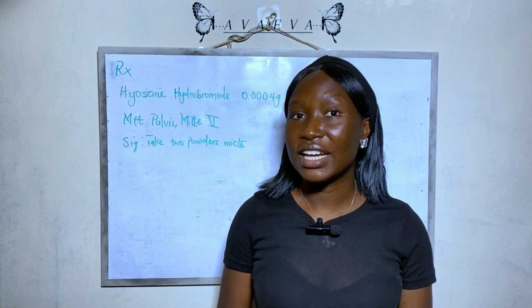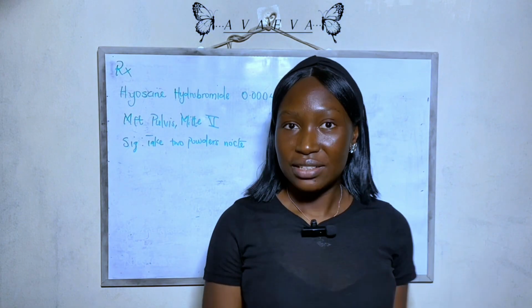Hi and welcome to today's episode of PCT 306 General Dispensing 1. On this episode, we're going to be looking at divided powders. Now, what are divided powders? Divided powders are a single dose of medicine in powdered form.